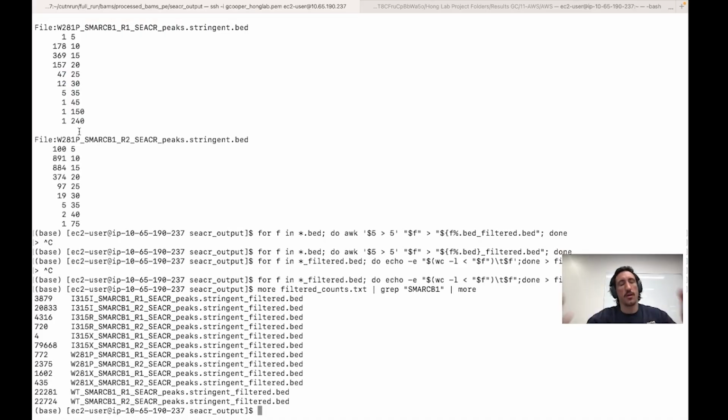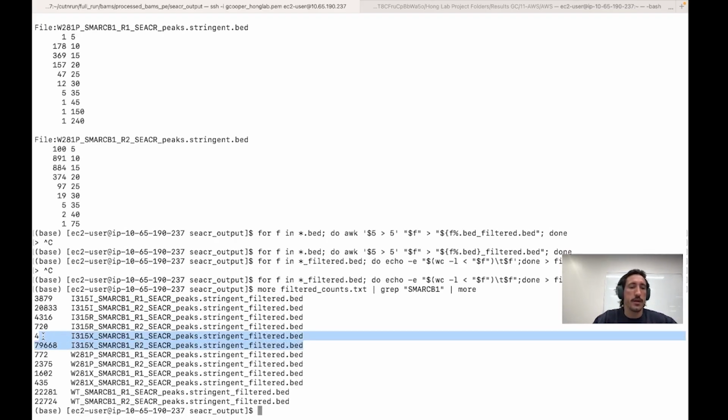So this is really just an artifact to make sure you don't have way too many peaks in your CUT&RUN data. And if I wanted to get rid of these, I could bump up the filter to something like 10, but then I might actually start filtering off some biologically important peaks up here. So there's a trade-off, and you have to kind of pick your battles and see which ones you want to filter. But ultimately, because we're only looking at peaks that are observed in 2 replicates, it should be fine as we go forward. And so we'll get into that in the next step.